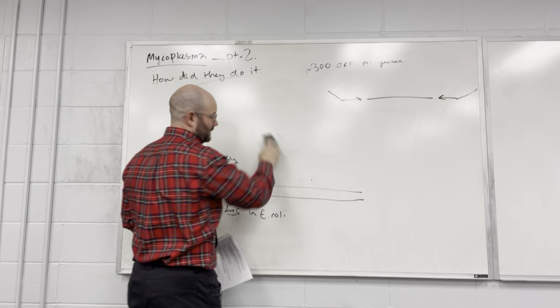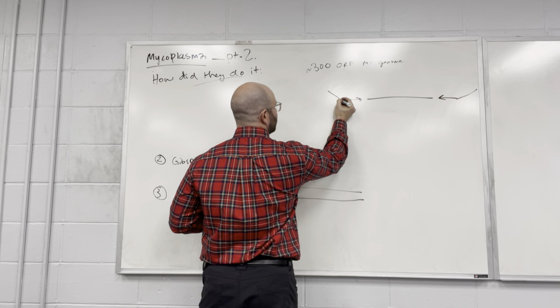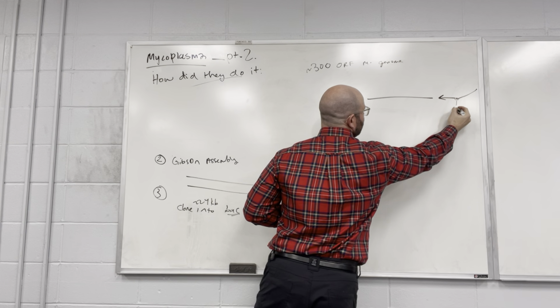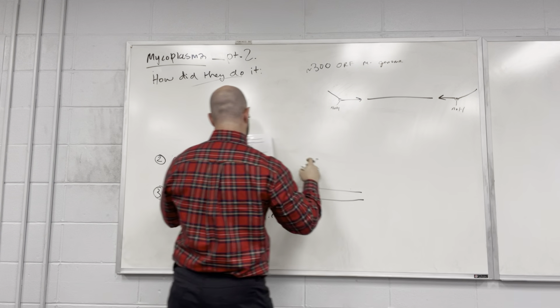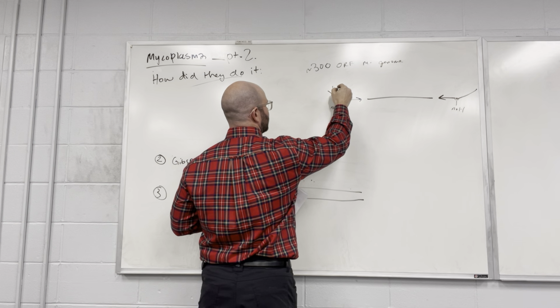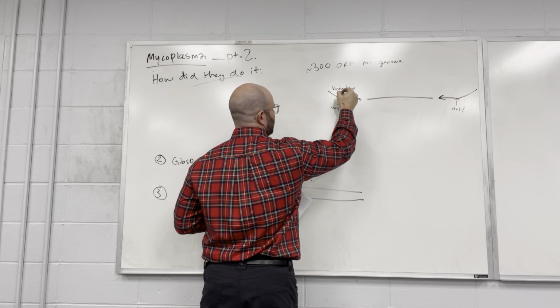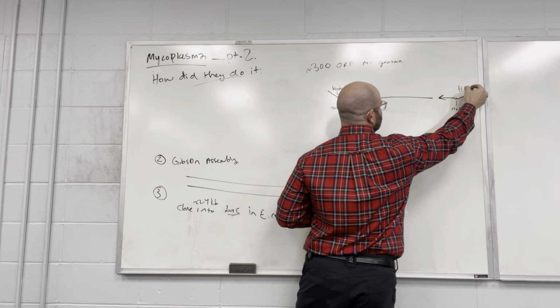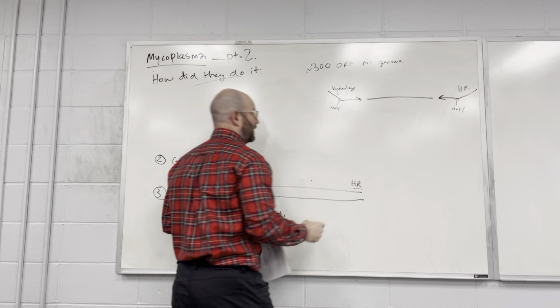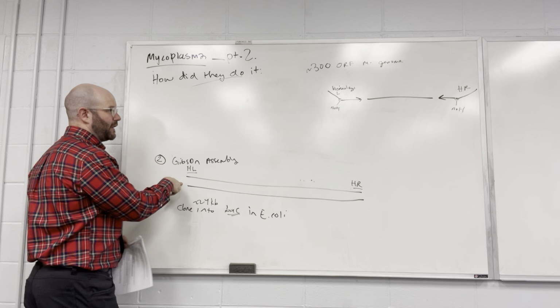If you look closely at the primers, there's a NotI site and a NotI site. And then this is essentially homology. Call this homology left, call this homology right. This one matches here, that one matches here.